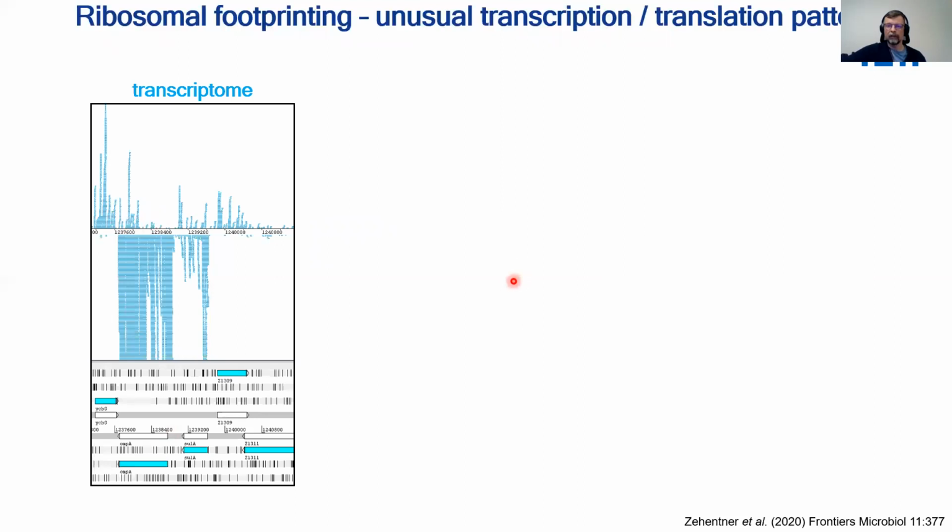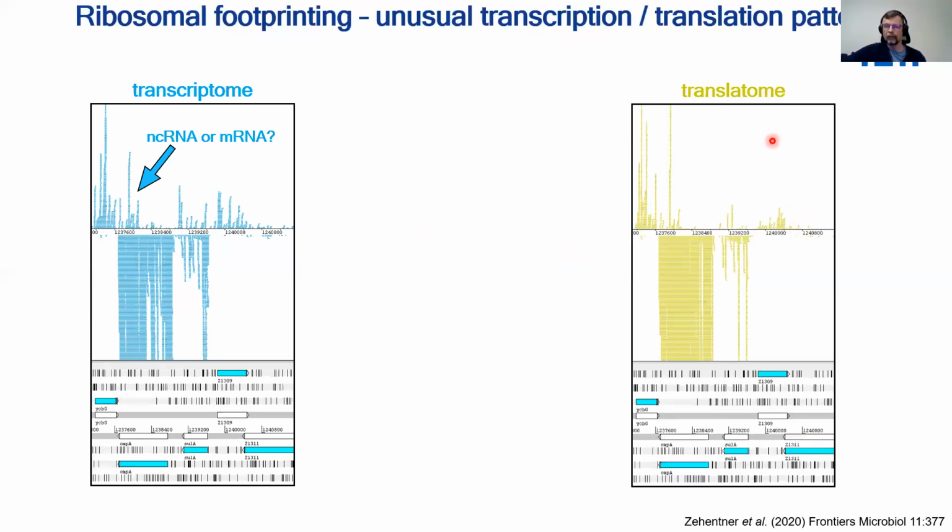Then we took our ribosome profiling. So here the question: non-coding RNA, or is it maybe messenger RNA? So we took the ribosome profiling, and suddenly we see we get also ribosomal footprints. So the messenger RNA had stuck in ribosomes and was translated. Not strongly, this is strong, this relatively weak, but still we get a nice signal. And if we do an overlay, translated mRNA, we see this for a gap, so to speak. So here's a gap, and there fits nicely a long open reading frame.